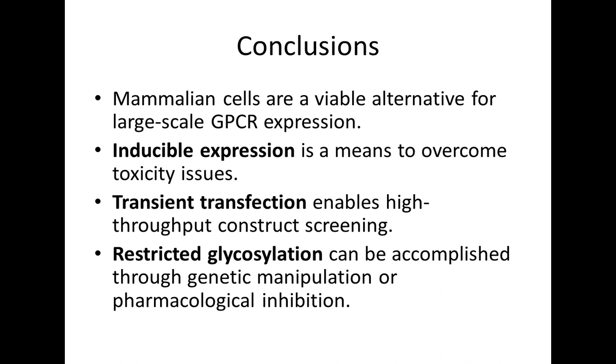Well, great, thank you. Do other tags besides FLAG give a reasonable level of purification from these cells? We almost exclusively use FLAG tag for purification.